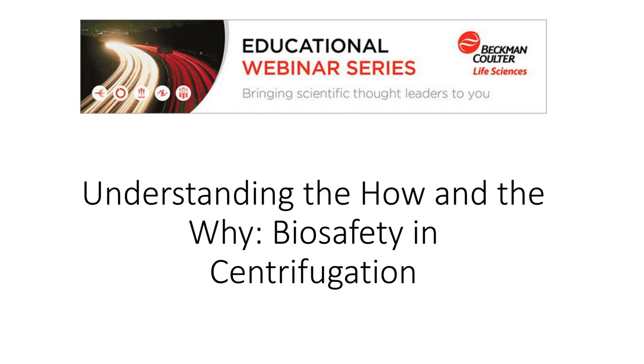All right, thank you. Next question, we are looking to have an OQ performed for our centrifuge to assess speed. Do you recommend an OQ be performed annually, or would there be another annual service besides the routine PM? I would again point to the regulatory requirements for your lab, your department, your organization in this OQ setting. If it's a GMP setting, often there are internal corporate timelines that need to be met with regard to GMP SOPs. So that really is specific to the organization.